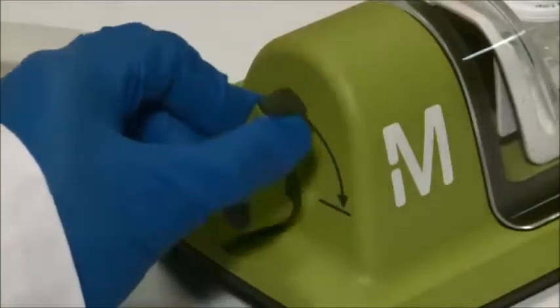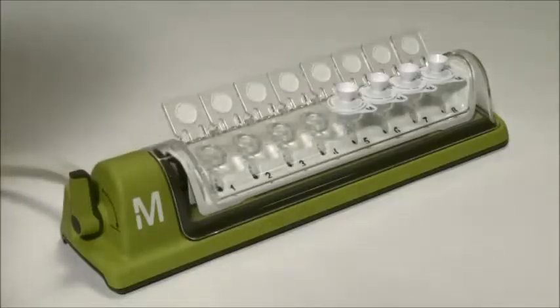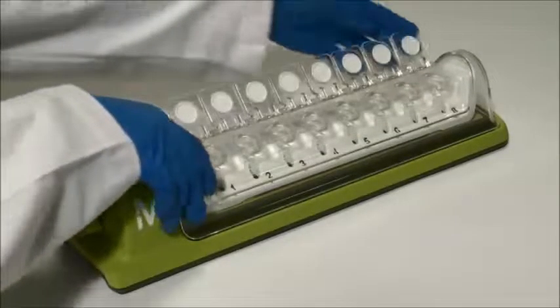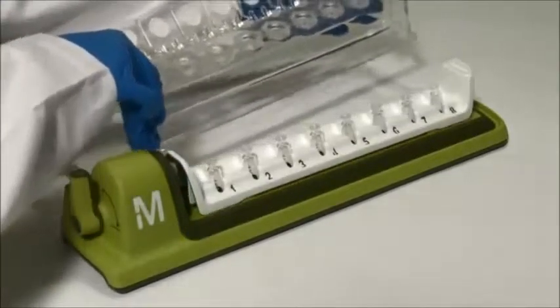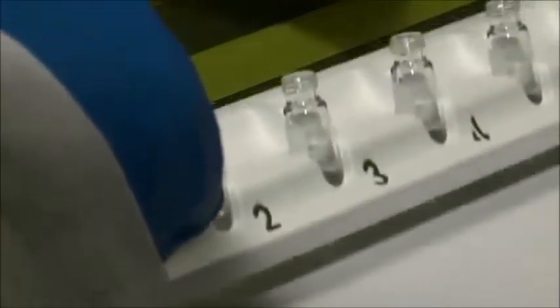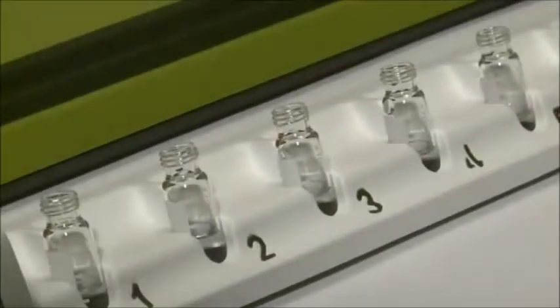Turn the vacuum off, and wait a few seconds for the vacuum to release. Dispose of the filters and remove the cover. Your samples are now particulate free and ready for analysis.